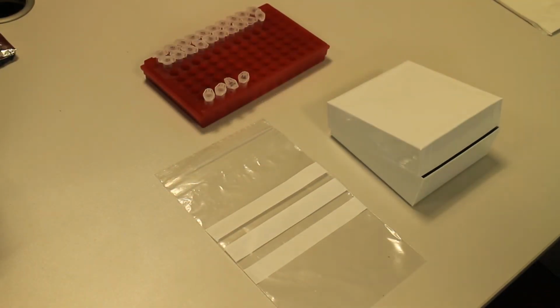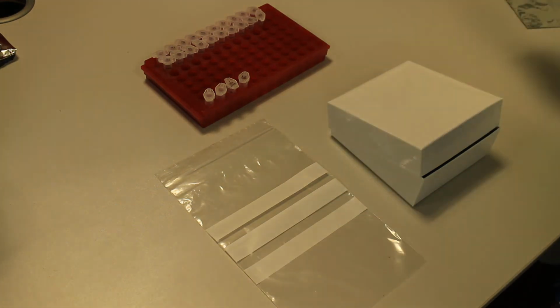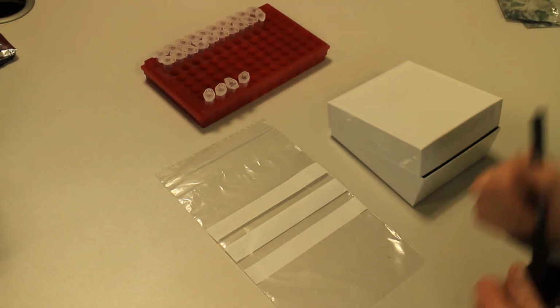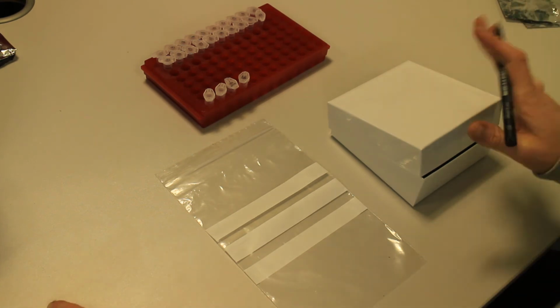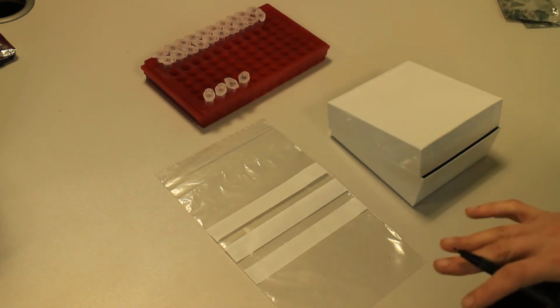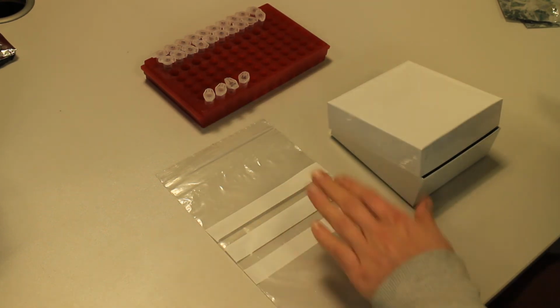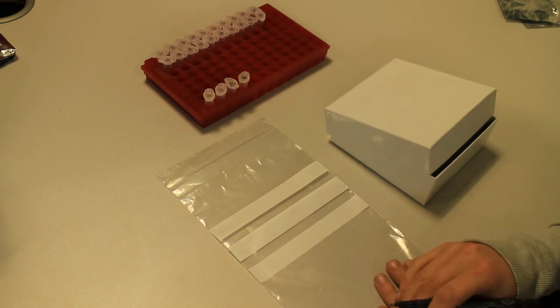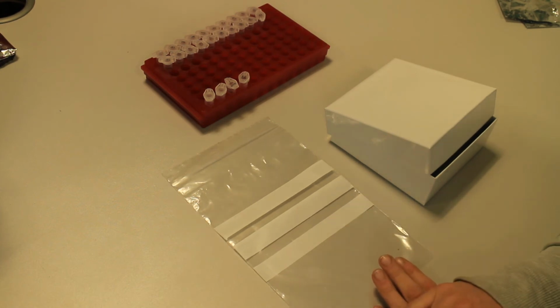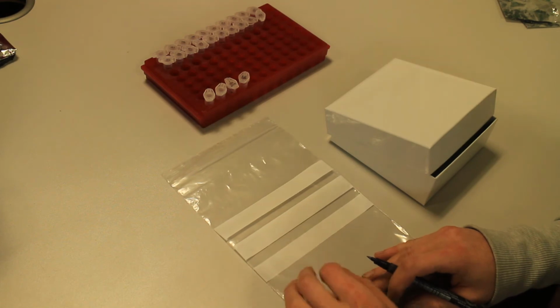When you collected your samples in these little vials, or also if you have them in your tinfoil bags, you will want to group them so that they are all kept together somewhere in the freezer. Same goes for, obviously, dry samples that you want to store. You want to keep them together somewhere. So you would keep them in a bag or in a box, and both of them you would want to label properly. And this is the stuff that you need to label in a way that people can identify it even if you're not in the lab anymore.